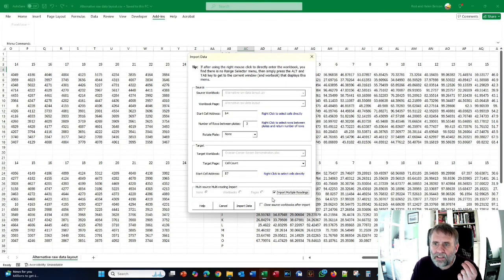If you were doing this, you're not going to be using multiple areas of the same worksheet. You're going to be associating the multiple readings with the different workbooks, and again that is clearly explained in tutorial 1. So I'm doing it slightly differently from you, or you can follow using this particular example. It's just showing you different ways you can use the generic importer to get all the data from the plate reading machine raw files back into your container workbook that you've built using the Platemaker Wizard.